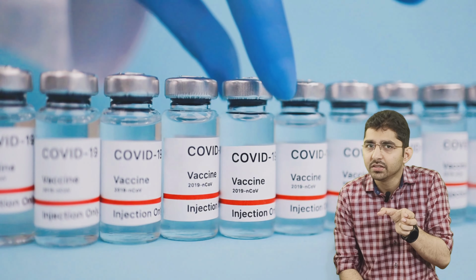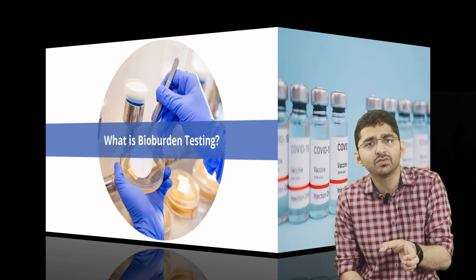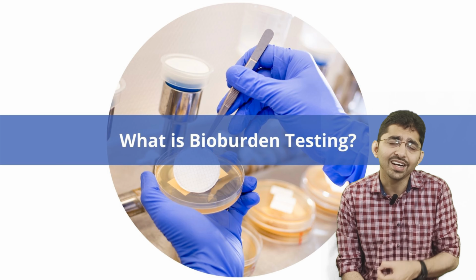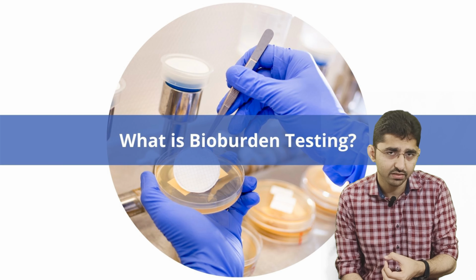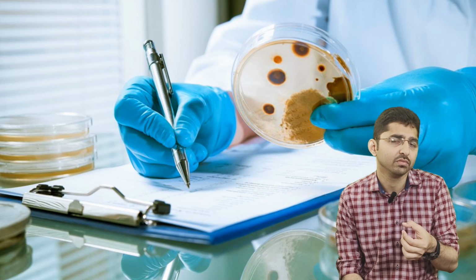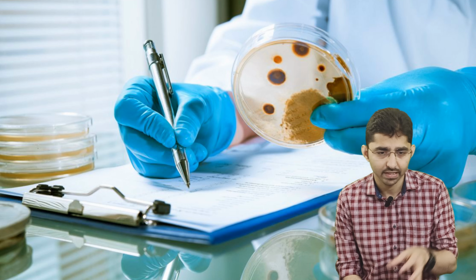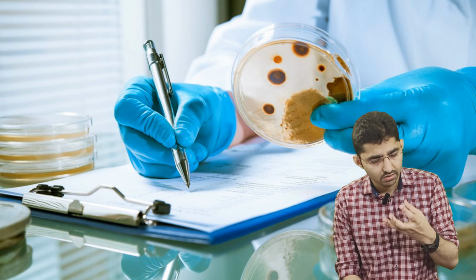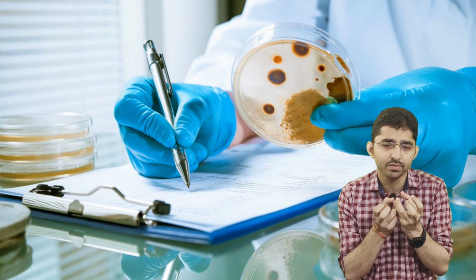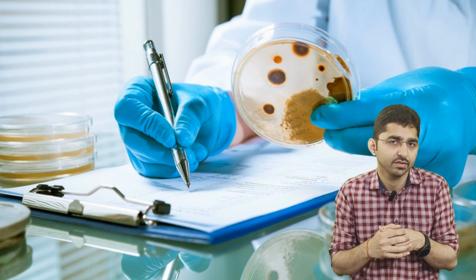Bioburden. So my friends, to understand this standard, you need to be well versed with the bioburden. I mean, what is bioburden? How to conduct the bioburden test, right? On the basis of which factors the bioburden depends, right? So you need to understand this in detail, which I am going to speak about in today's lecture. So bioburden means a population of viable microorganisms which are there on a product or in a product, right? It is clear.